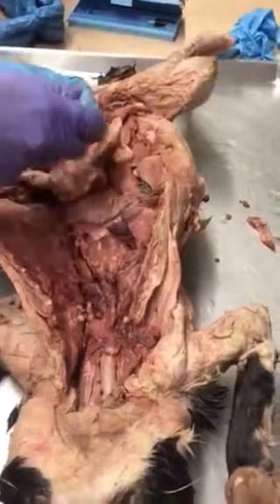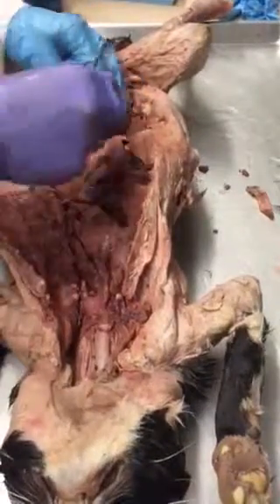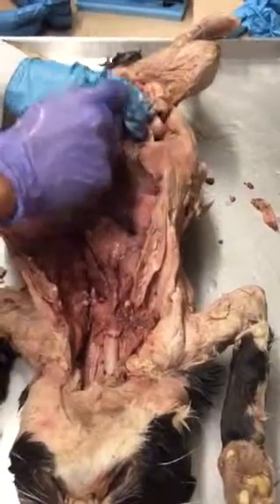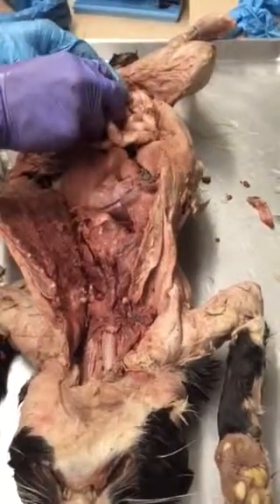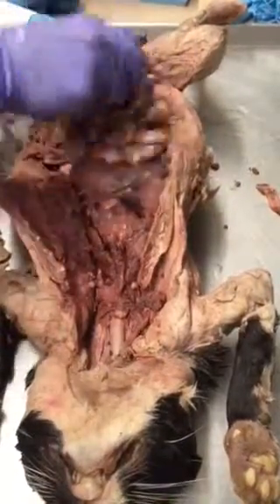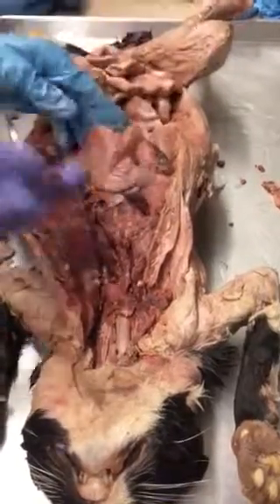That's the cecum. What's the specific structure? Cecum. It's kind of C-shaped. What is this specific segment of the small intestine right here? Duodenum, because I'm near the stomach. Most of this stuff is what? Jejunum. And this last segment of the small intestine is going to be the ileum, ileum with an E. All right, good.